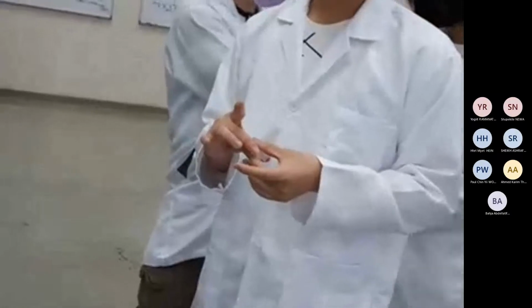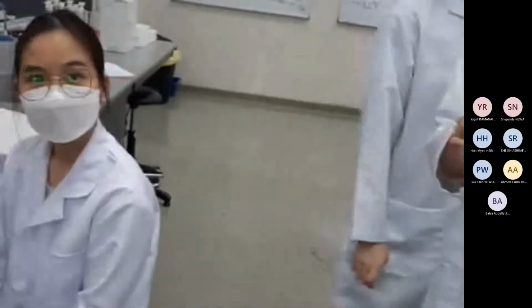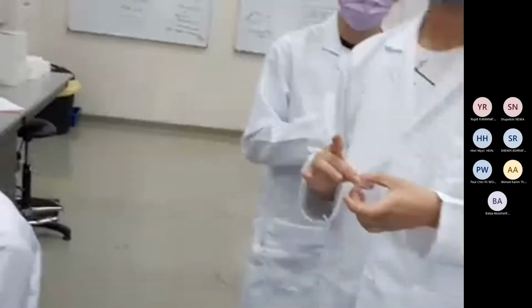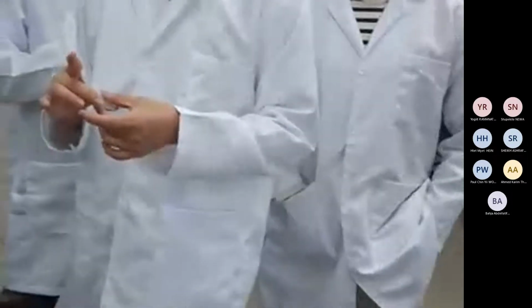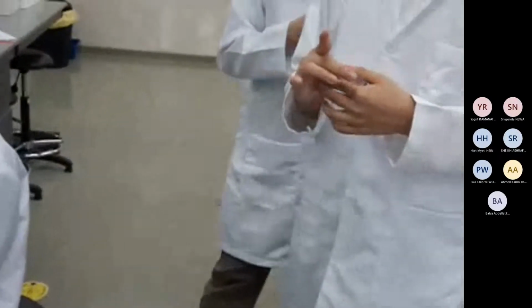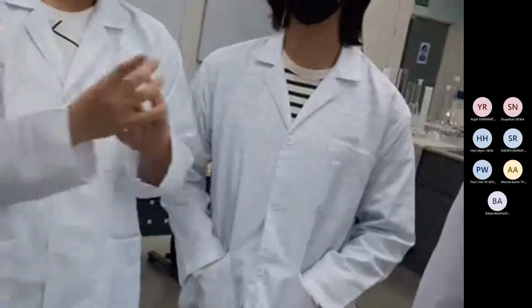Anyway, so you take a little bit of it and smear it all over the sides, and then throw it away, before you use the sample. Otherwise, because this instrument is quite sensitive, if there is any trace, it will give you the result based on that, right?